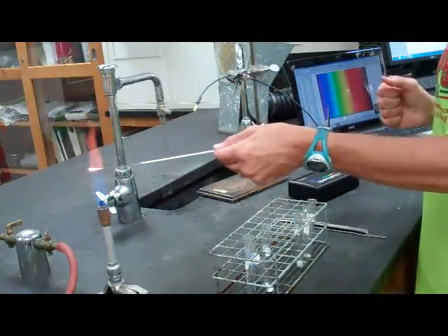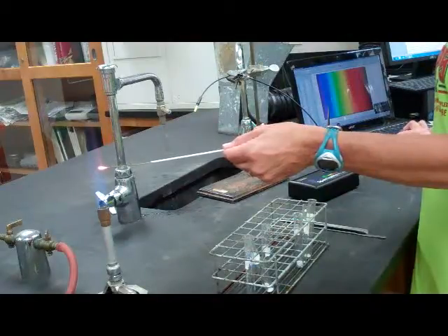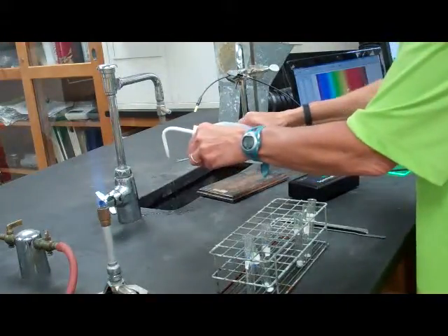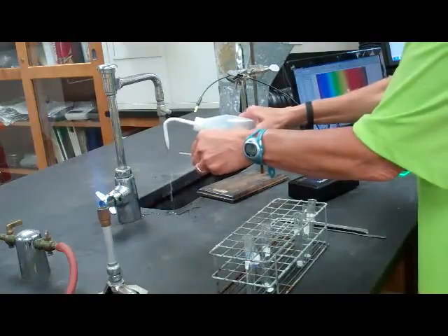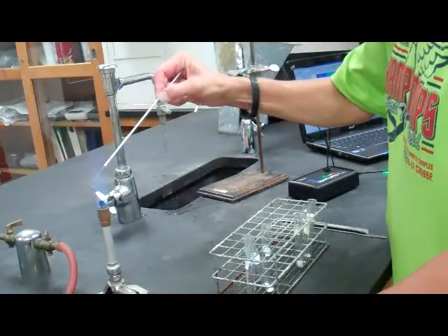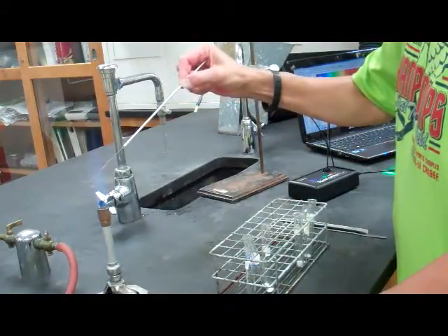Again, you should note those colors as you're doing this, and then once you have a reading, we will rinse the loop again, burn the loop, starting from the handle end, making sure all contamination is gone.